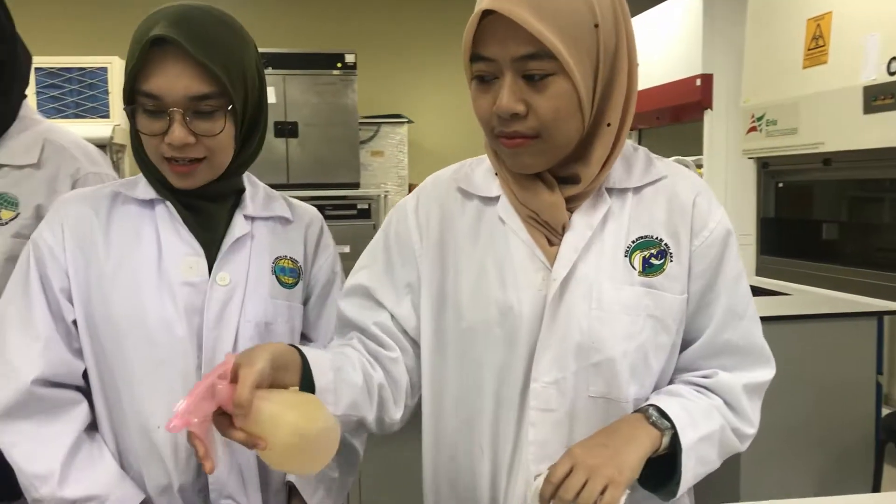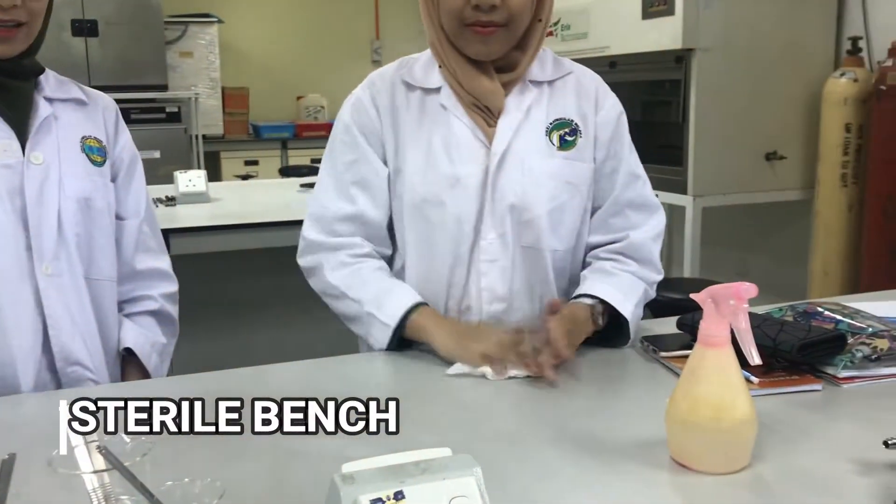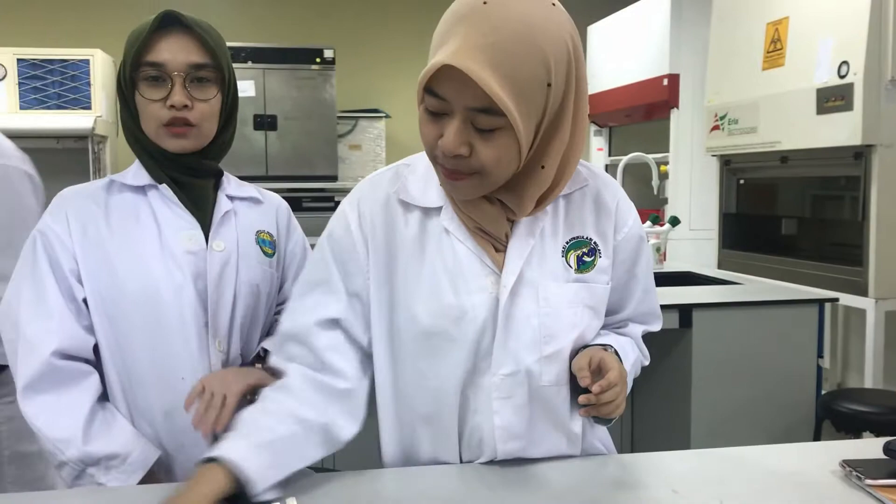First thing, we have to spray the alcohol onto the table to sterilize the table that we are going to use.